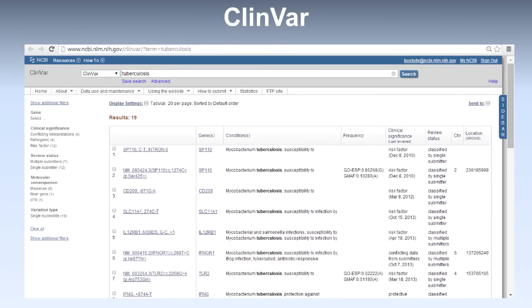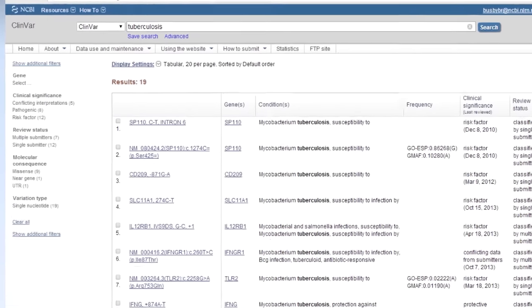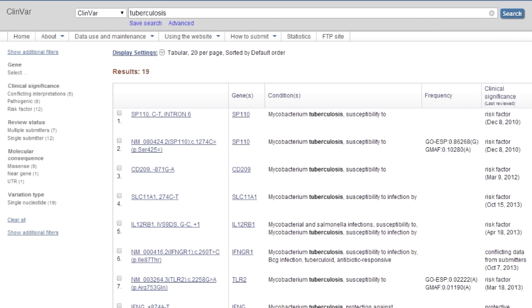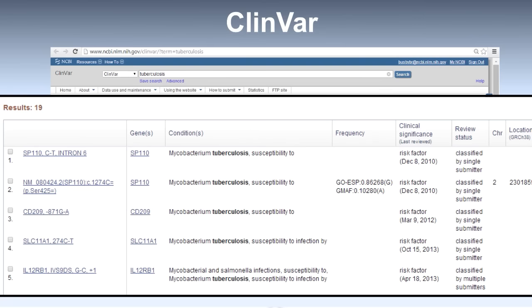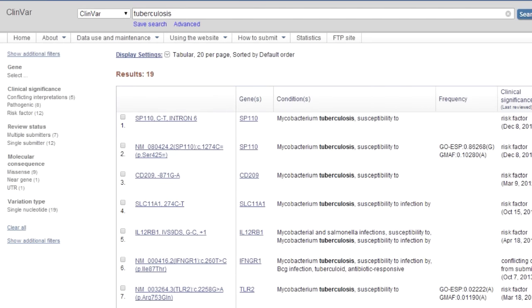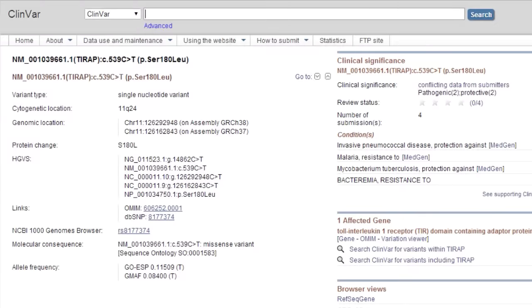The first database I'd like to show you is ClinVar. ClinVar is a database of sequence variants asserted to be associated with phenotypic variants by particular submitters. As you can see, we have some genetic variants linked to susceptibility to tuberculosis. We can take a look at some of those variants and see that they are related to susceptibility. Another thing one can do at the ClinVar website is look at the evidence coming from different submitters. In this particular case, two submitters have claimed that a particular variant is pathogenic and two have claimed it's protective.